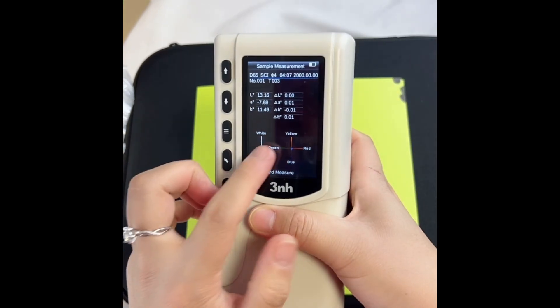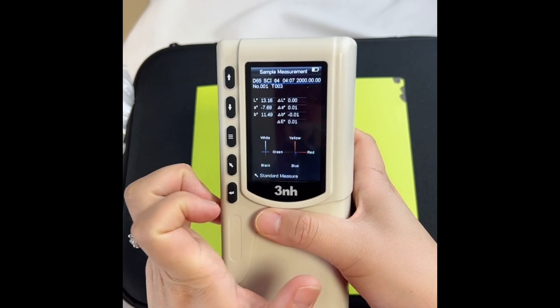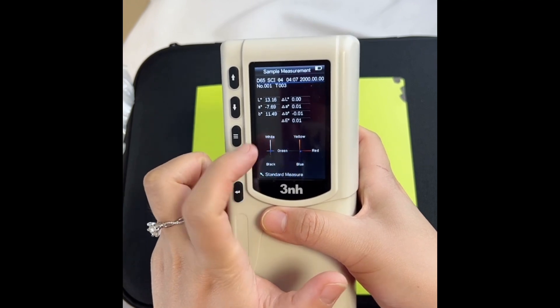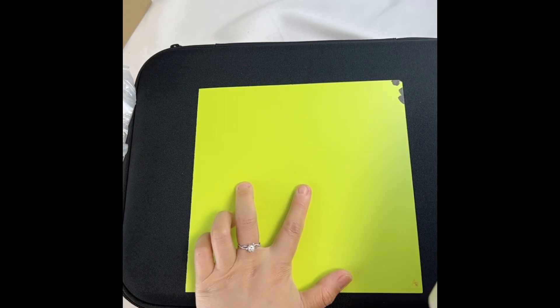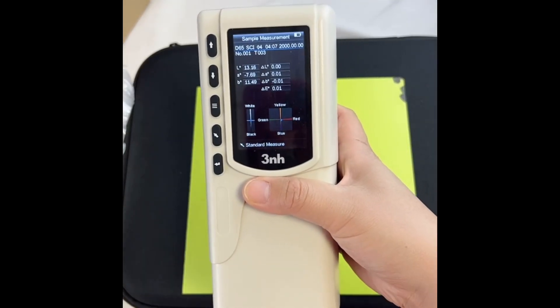Then we will get the data. It's the color difference. We can see the color difference is very small, so this color here and here — it's the same color. That's all, thank you.